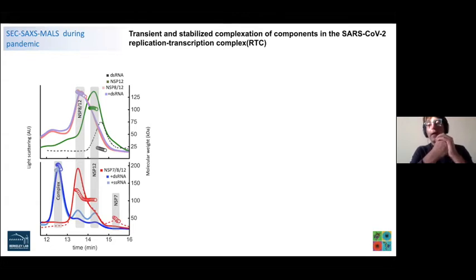But there is an application, I think, in Grenoble. They don't use it so often. Again, subtracting the buffer from the peak of interest is not trivial. But yes, I was thinking also for DNA protein complexes, sometimes you can use DNA columns as a specific design for separating the free DNA from the protein complex. That may be also useful. But yes, that's our future. So far, we have so many users with the size exclusion, and I'll be happy with that.